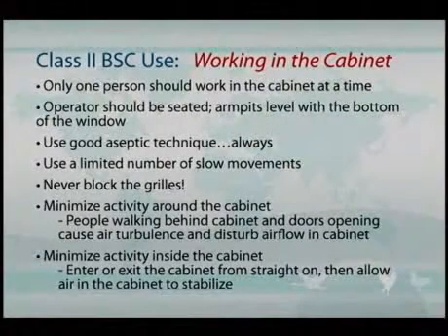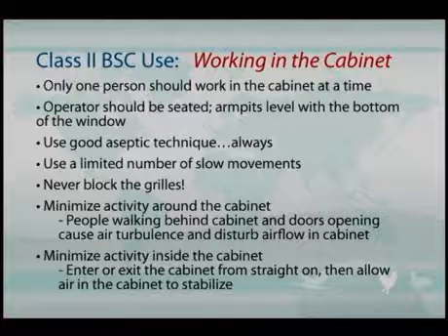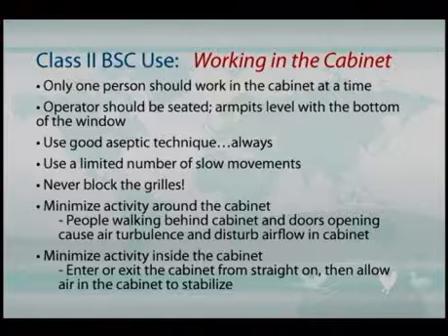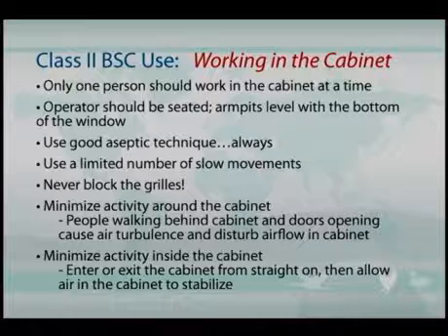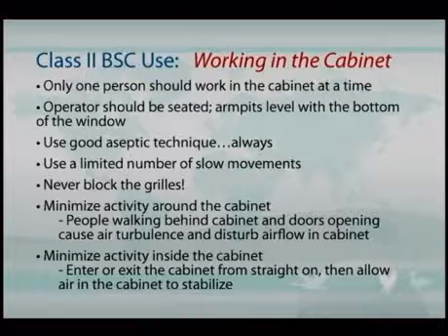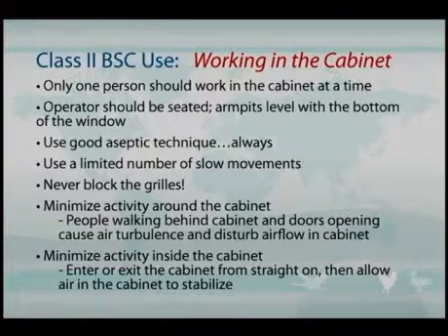Only one person should work in the cabinet at one time because, again, you're disrupting that airflow anytime you have a lot of activity going on within that cabinet. The position of the operator should be so that the armpits of the operator are about level with the bottom of the window, and this then assures that the operator is not sitting too low, where exposure to any movement of air from inside the cabinet outside by the movement of hands or arms would cause exposure to that person.